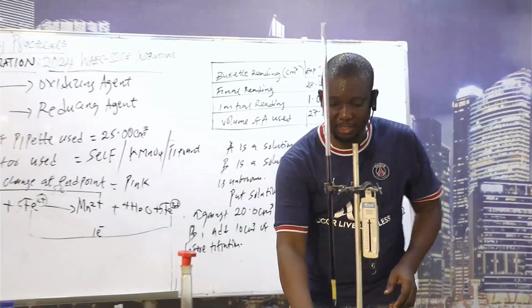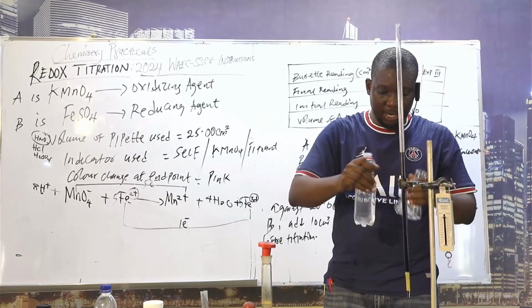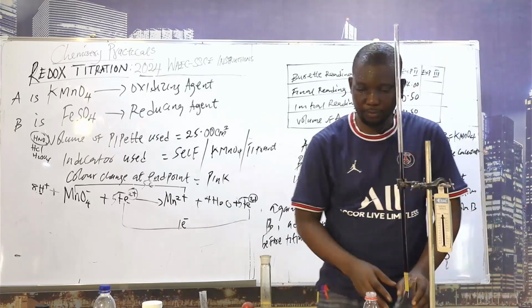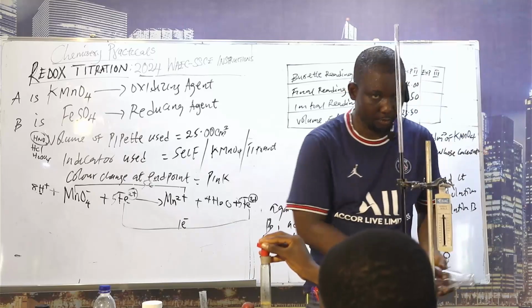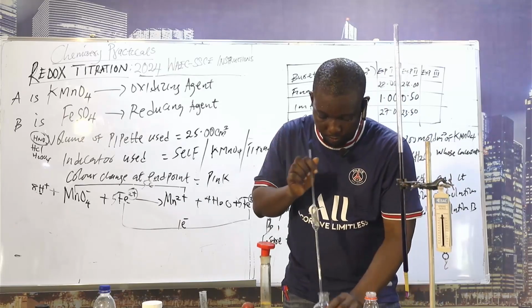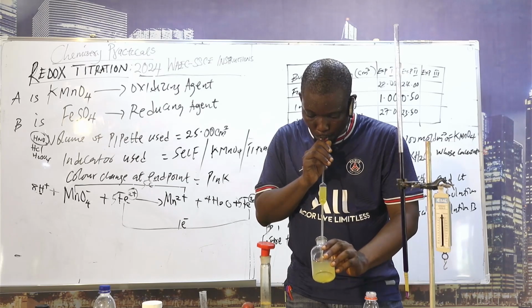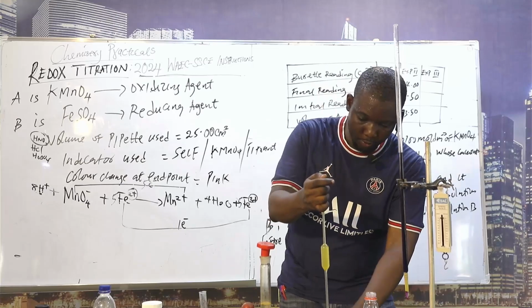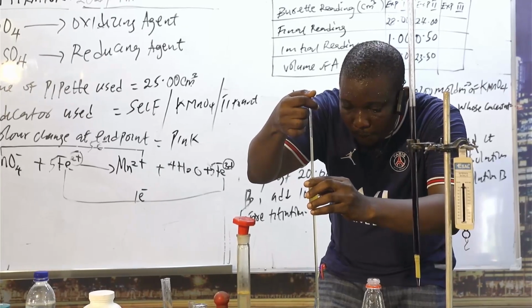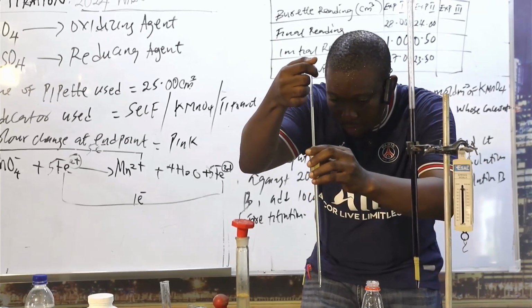So we refill, but be very fast because you're under exam conditions. Don't forget to rinse with distilled water. This last titration, you'll be very careful so that the two will be consistent.